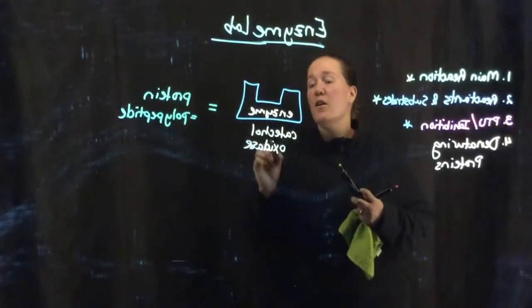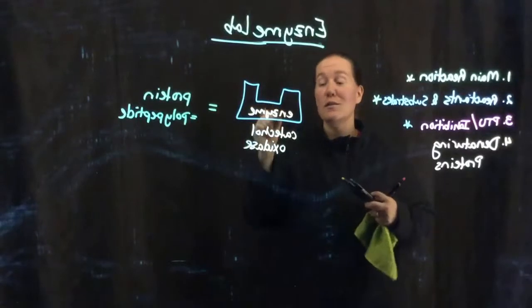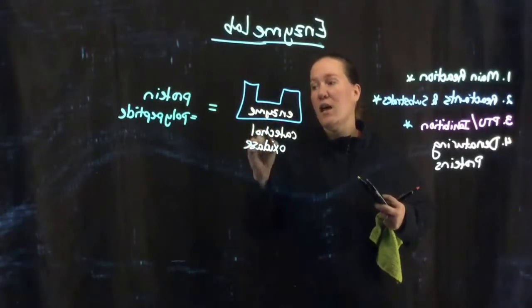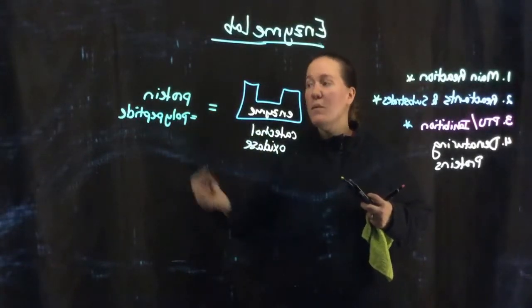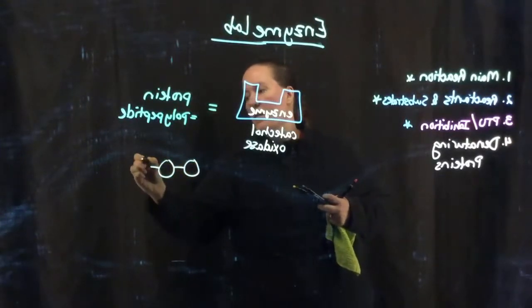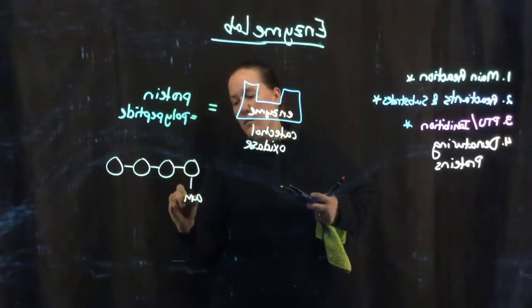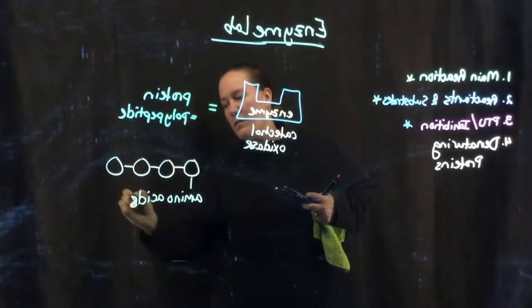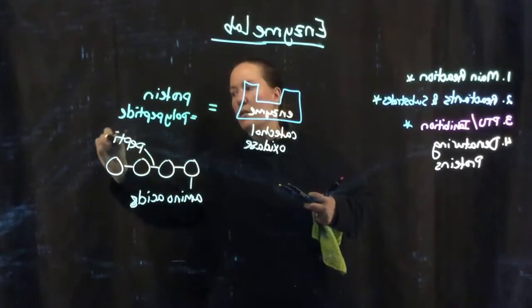Okay, hi guys. So this is our enzyme, and hopefully we are all really sure that this is catechol oxidase. So we milked that potato, produced this enzyme, and it is really a protein. So it's a polypeptide, and what we mean by that is it's a bunch of amino acids linked together with peptide bonds.